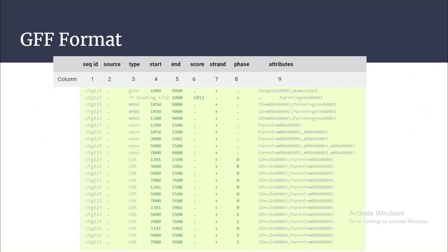Let's take an example with GFF file format. Each row corresponds to one feature, and the columns give you information about the features — such as what is the type, start, score, and so on. We will go through them one by one.